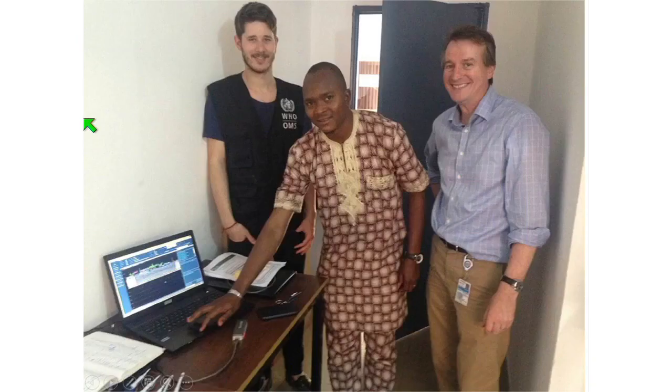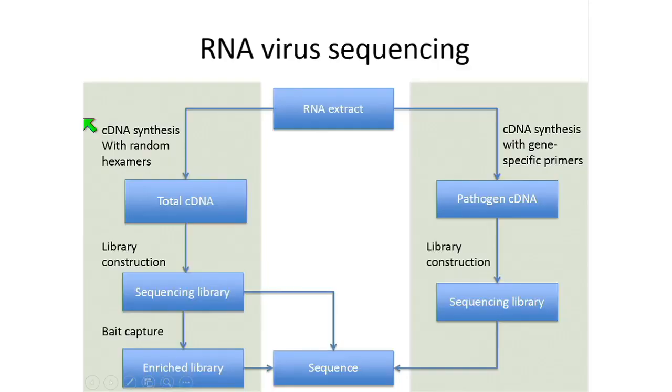And really notably, and this is one of the things I think is underestimated about nanopore sequencing, within 2 days of Josh arriving, and this is a picture of Josh and Mark Carroll who helped set this up, and Dr. Masuma starting the very first nanopore run. So within 48 hours, we're able to generate a library and generate Ebola sequencing data. And if you try and do that with a conventional sequencer, I'd be surprised if you can get data off the instrument in less than a couple of weeks, if not months. So that's a kind of an impressive facet of the system.